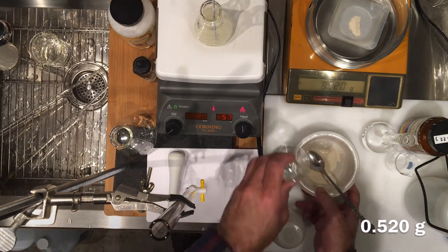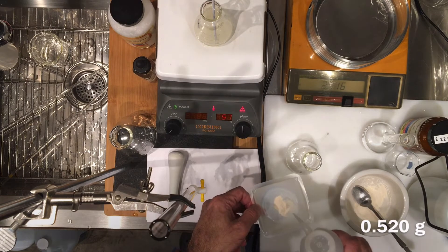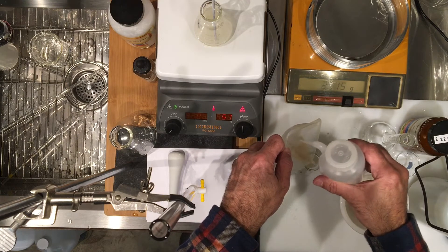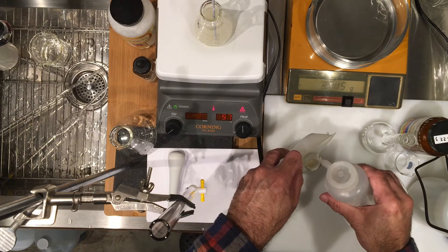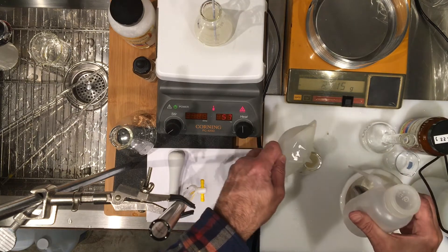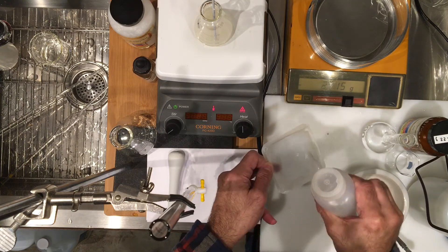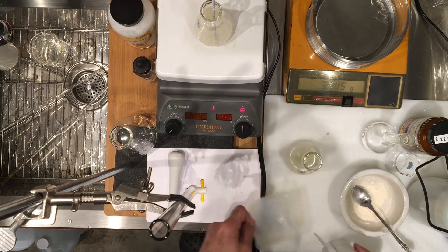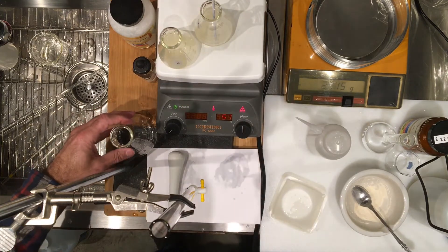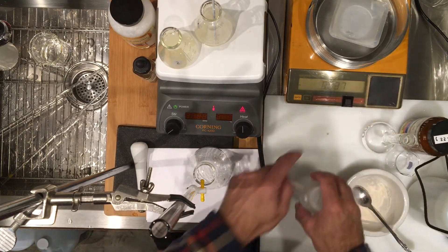That goes into the second smaller flask. My hot plate has enough surface, so I'm putting the second flask on to heat up too. Now let's work on getting our third flask measured.